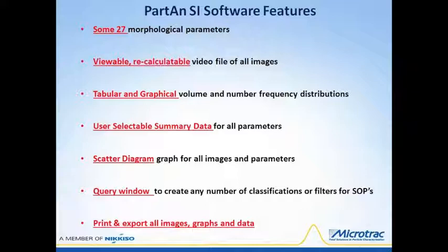And all data in the form of image files, graphs, and data tables can be readily exported to spreadsheet, copied, or printed. And finally, classifications to isolate separate sample components and filters to remove unwanted particles, evaluated using the query window, can be set up in SOPs. We'll touch in more detail on this and others later.